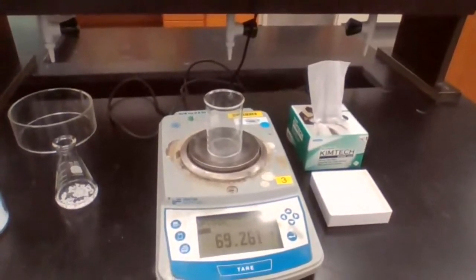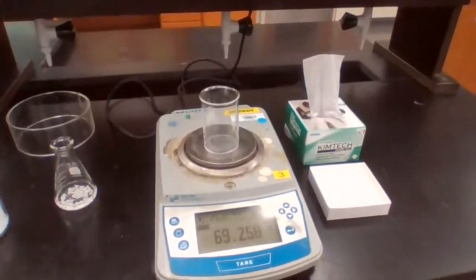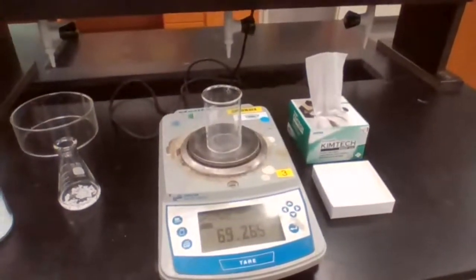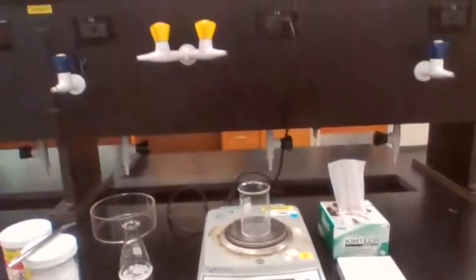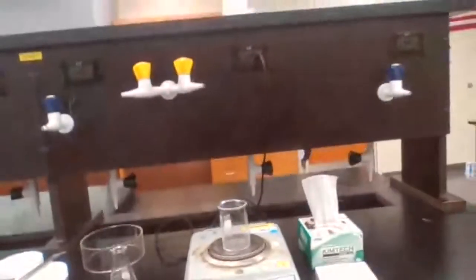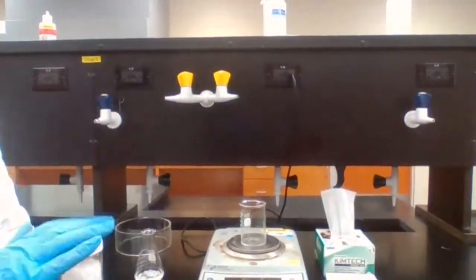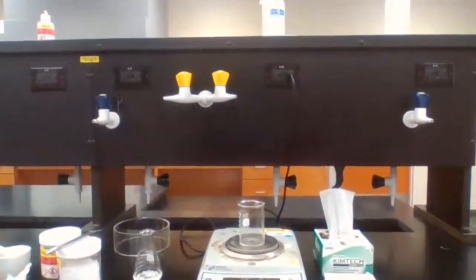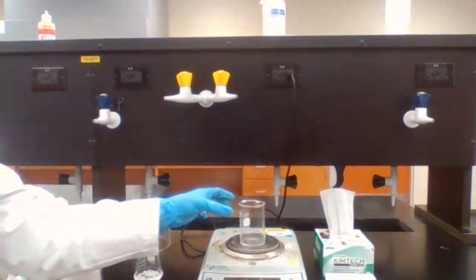See, it's moving a lot. The number is changing because I'm talking and the balance is very sensitive. Whatever number that you catch, that's fine, because the difference is in the decimal, so it goes 69.26 to 69.27. It's jumping up and down. So whatever number you have there is going to be good enough, the number that it shows without disturbance. For your record, I'm going to give you the number that stays there more often: 261 was the number that it showed more often.